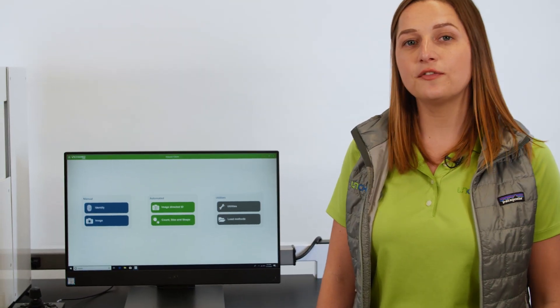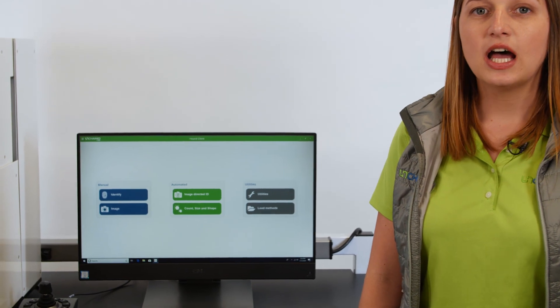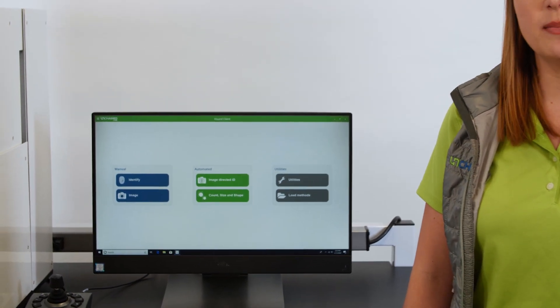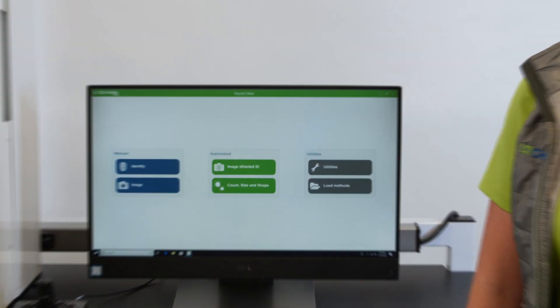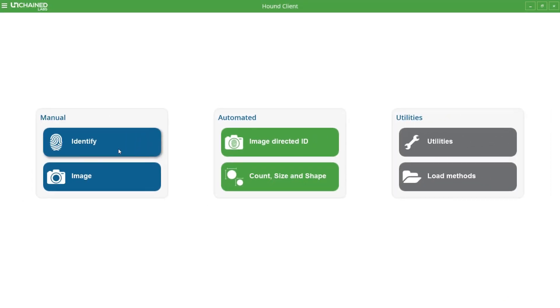Since I only have a few particles, I'm going to use the manual identify application. But keep in mind that Hound has an automated mode, so you can analyze hundreds or even thousands of particles at a time.